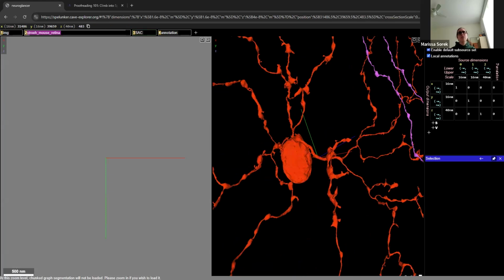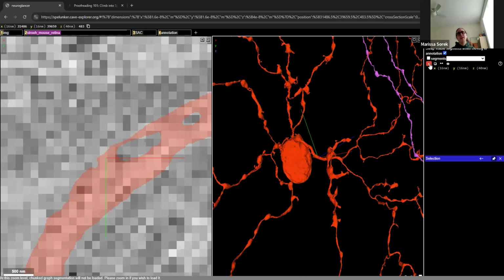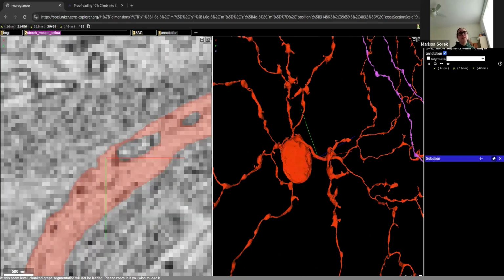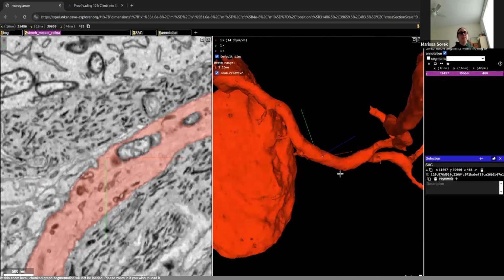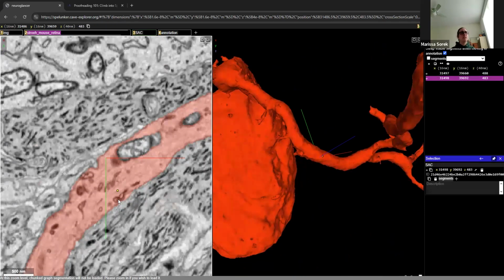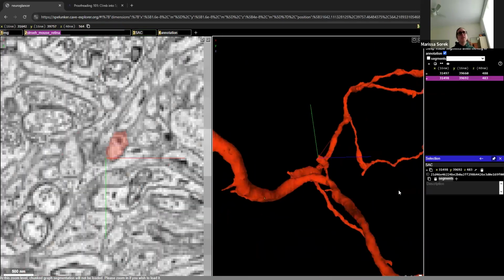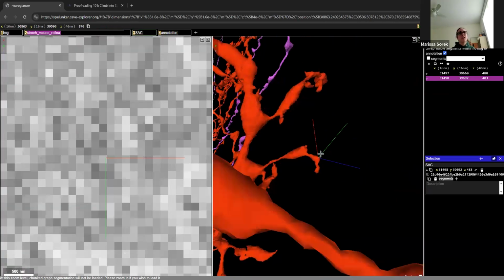You'll click on annotations, and to start annotating, you click this dot here, and that says annotate point. Now I'm in annotate point, and you can see that in our upper corner telling me that I'm there. I can use Control left click to place a point either in our 3D view, so you can see that little yellow dot there, or in our 2D view. This is helpful if we want to mark particular regions where we think there might be synaptic connections or something like that. Definitely helpful, and we can leave notes for ourselves.